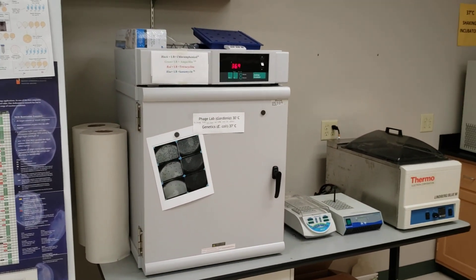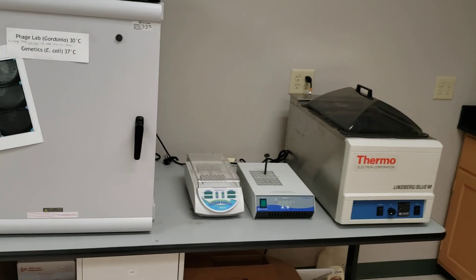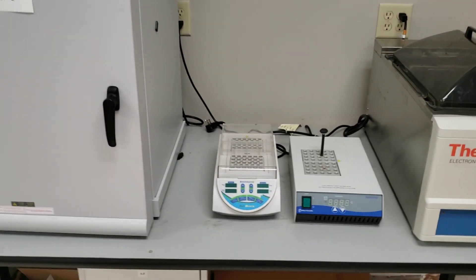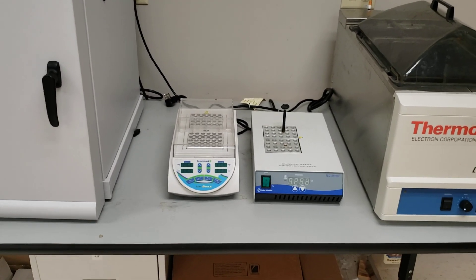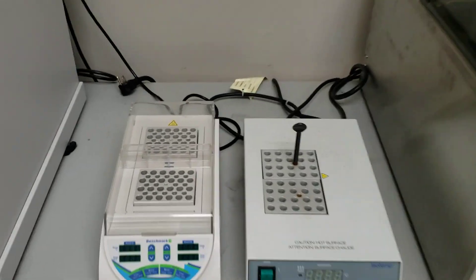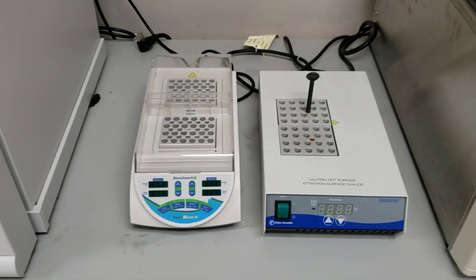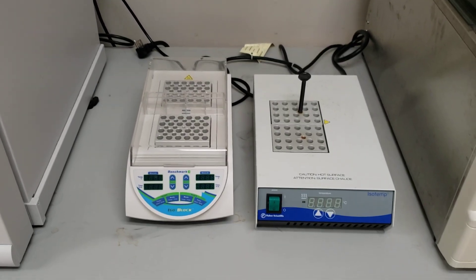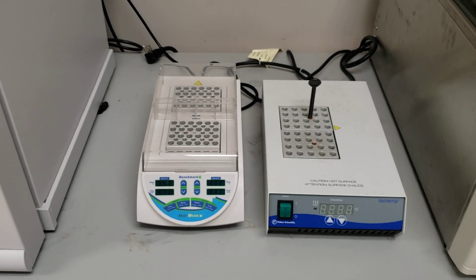I have a 37-degree incubator — nothing fancy. I also have a dual heat block system because we do digestions at one temperature but also need to do heat inactivation at another temperature. I used to have one heat block with both together, but students were always getting them confused and denaturing their enzymes at the wrong temperature. So I bought a second heat block to keep things clear.